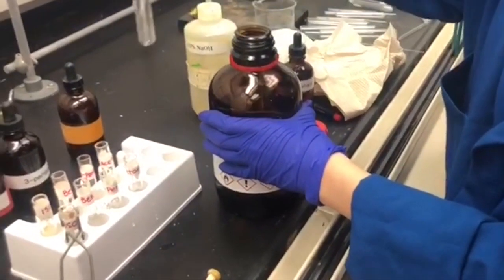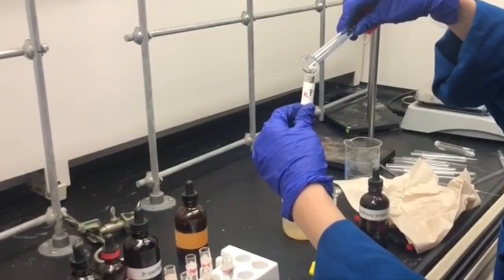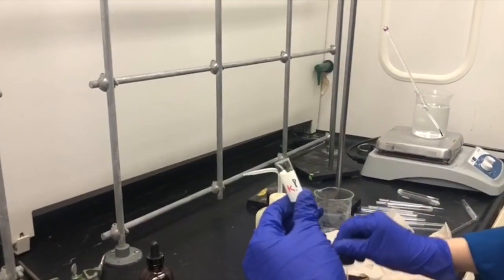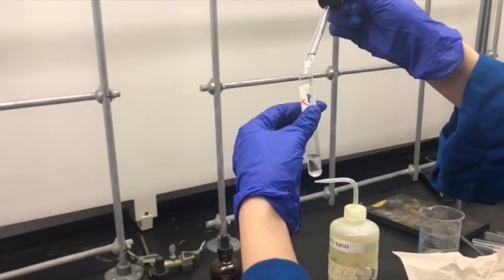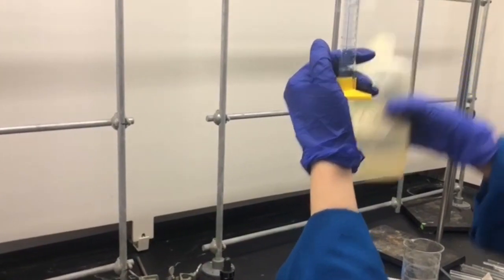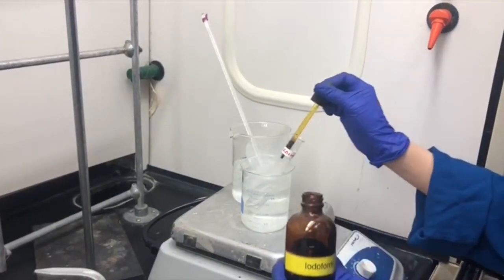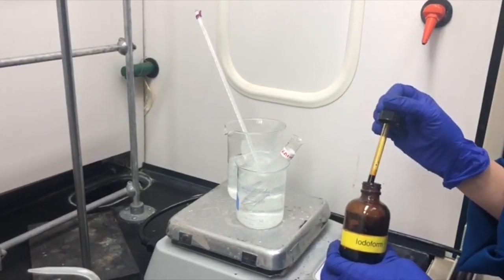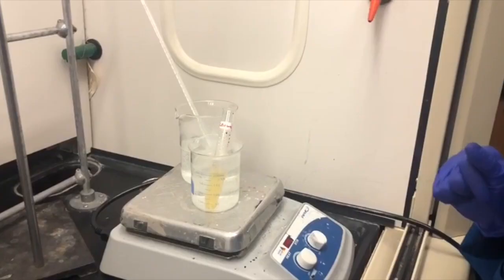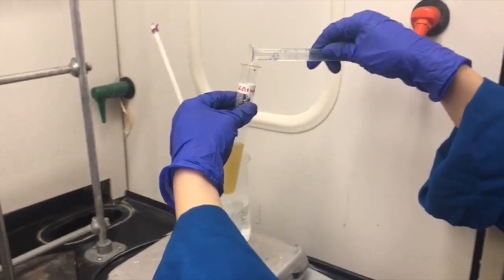Finally we're working on our unknown. I'm adding 5 drops of it into the test tube, then 2 ml of water. Now adding 1,2-dimethoxyethane drop wise until compounds are dissolved, then 2 ml of 10% sodium hydroxide, and into the warm water bath it goes. Adding the iodine solution until it turns brown — this one also precipitated immediately. Adding 10% sodium hydroxide drop wise until the solution turns colorless. We left that in the warm water bath for 5 minutes and diluted it with cold water.